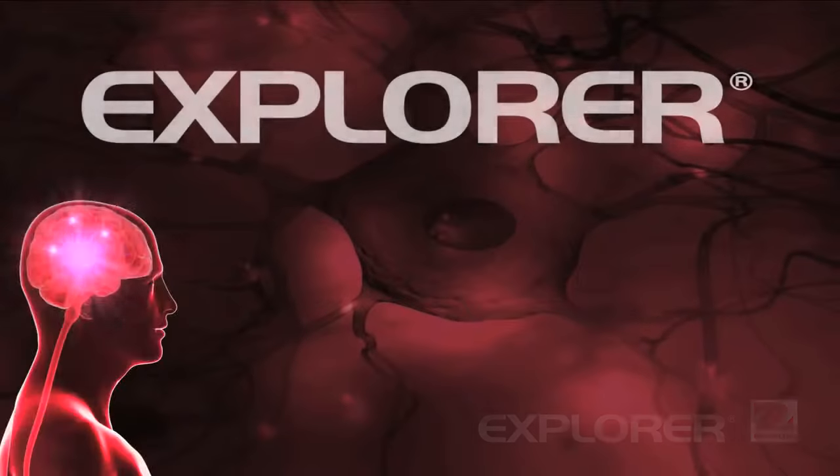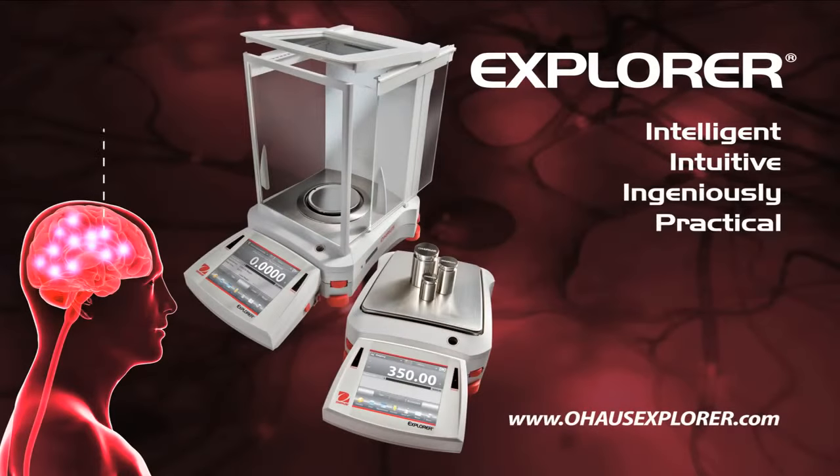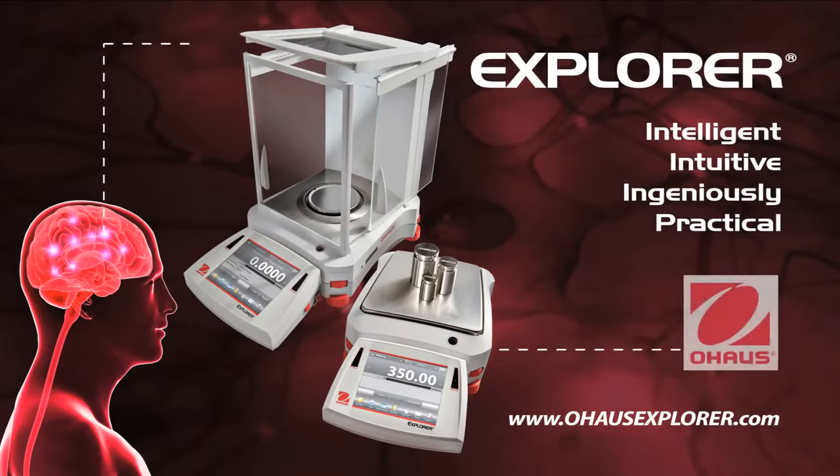That's the all-new Ohaus Explorer — the most intelligent, intuitive, and ingeniously practical balance ever to come from the mind of Ohaus.